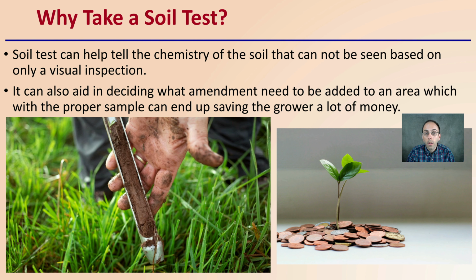As an example, if I only sample from this area, what could have happened in that area? Well, there could have been a fertilizer spill. There could be a vehicle or a tractor parked in that lot. There could be animal droppings. There could be uneven drainage in that area. A whole potential host of reasons, which is why you don't want to just take from one area. You want to take from multiple regions, collect them together to get a good field representative sample.